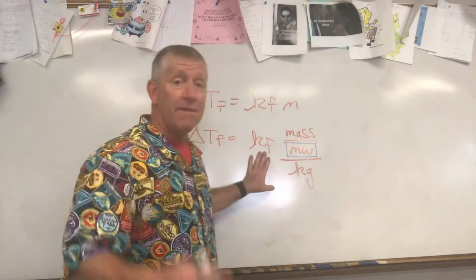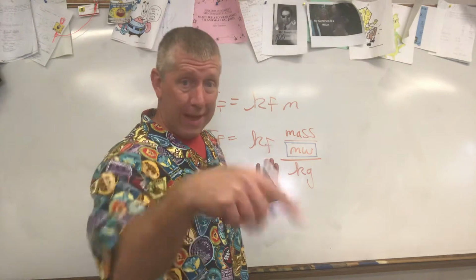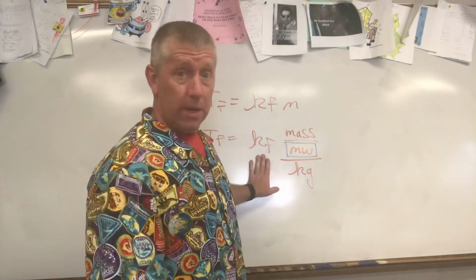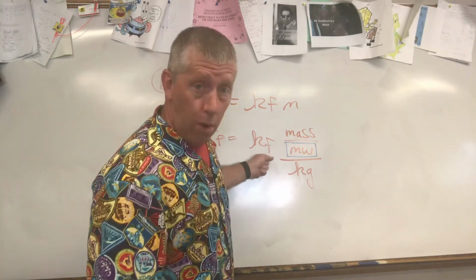The Kf is a standard value. Now, I've used it in many videos, so go back and watch it. Or if not, just look it up on your own. I'm not going to do it for you, lab partner. You're going to do something here. So get the Kf for water.